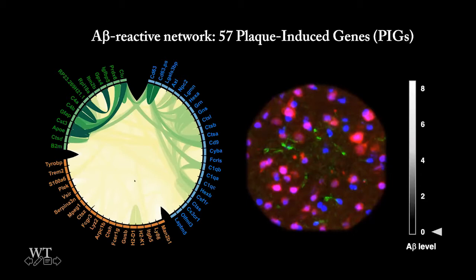And you see that the network is split into 3 subgroups. They don't really connect. So the green subgroup has strong internal connectivity, and most of them seem to be expressed by astrocytes. And the blue subgroup has mild internal connectivity, which might be expressed by microglia.